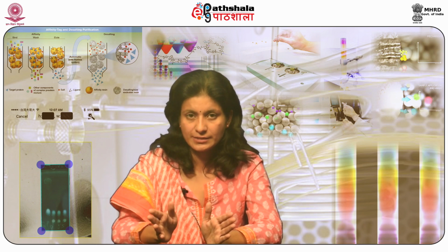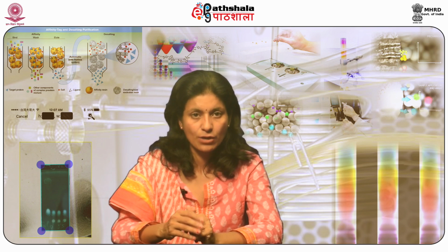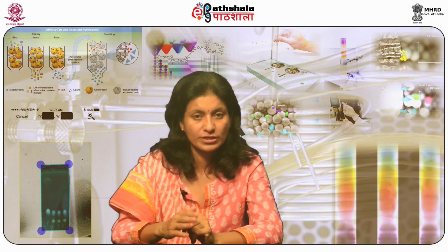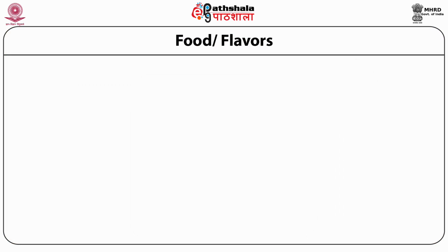IEC is broadly accepted as the specialized reference method not only for wastewater analysis or for water but has the potentiality to meet the requirements of the standards. It is nowadays increasingly recognizable in the laboratories of industries, like evaluation of heavy metals and cyanide polyphosphates in electrochemical and tannery waste, chemical purity and heavy metal analysis in fertilizers, analysis of alkaline earth metals, sulfur and chlorine in paper industry. Food flavors.